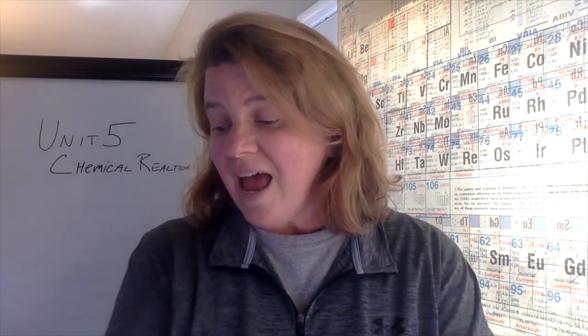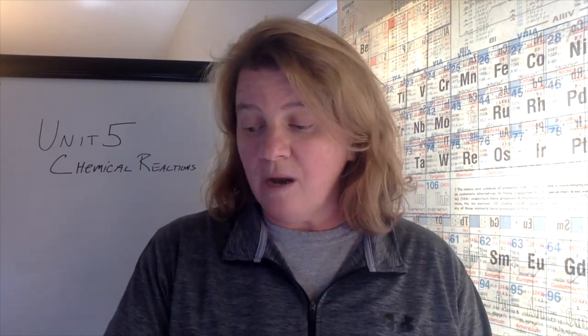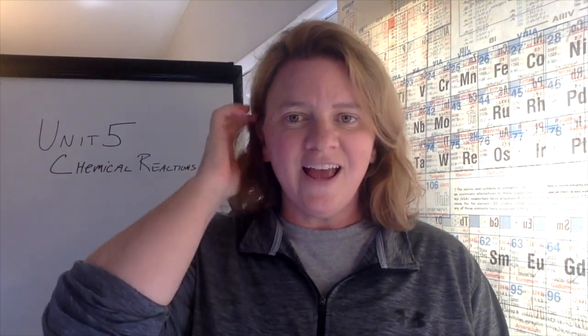Okay, you then have 3 analysis questions. All right, so make sure you answer those, especially number 3. Make sure that you're writing balanced equations for each of those reactions and state the type of reaction that is taking place. All right, enjoy the lab.